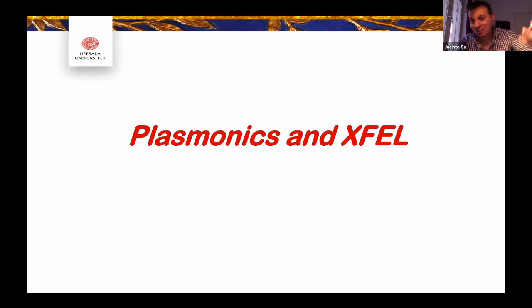But we then realized that of course we needed to do method development when it came to measuring the plasmonics. So this talk will be a little bit about what we use the X-rays to see on the plasmonics and what we want actually to see going forward.